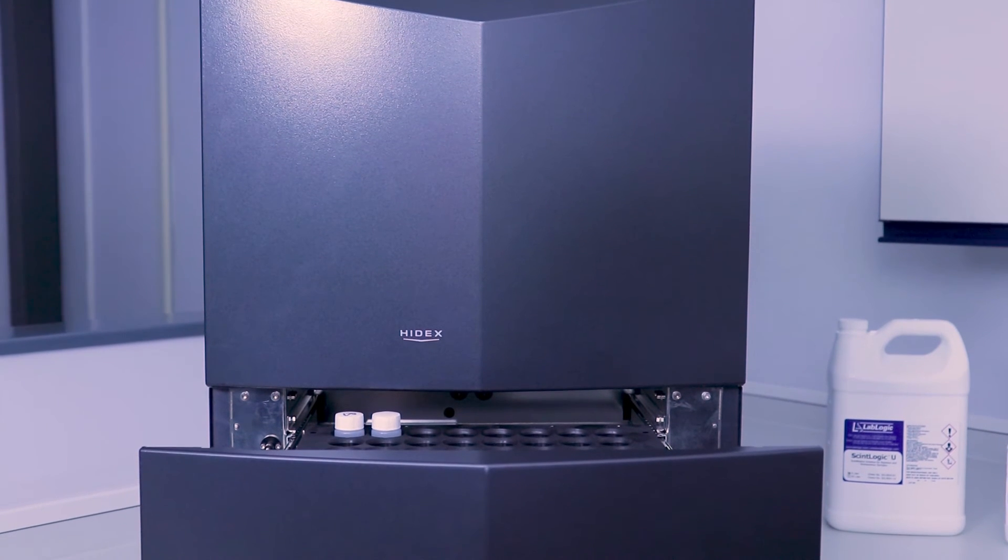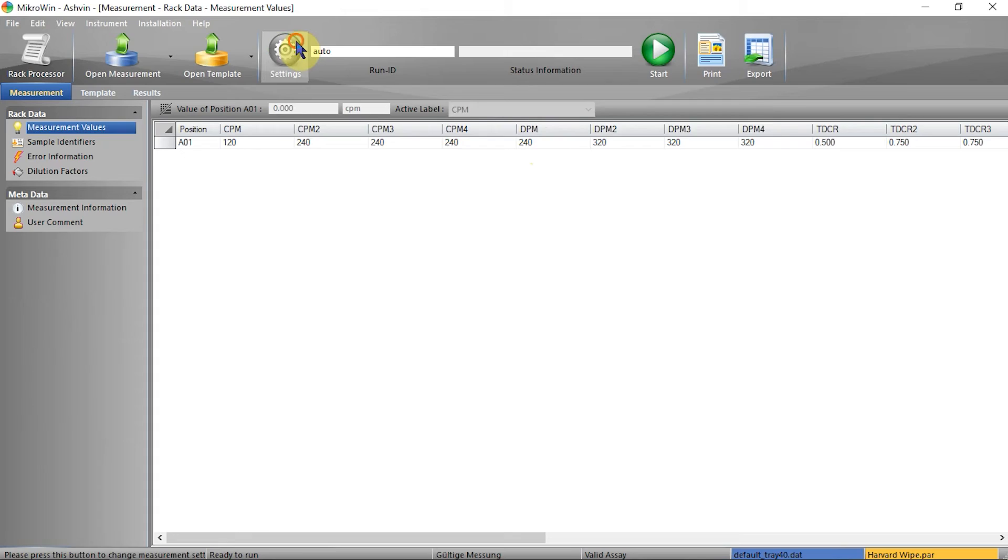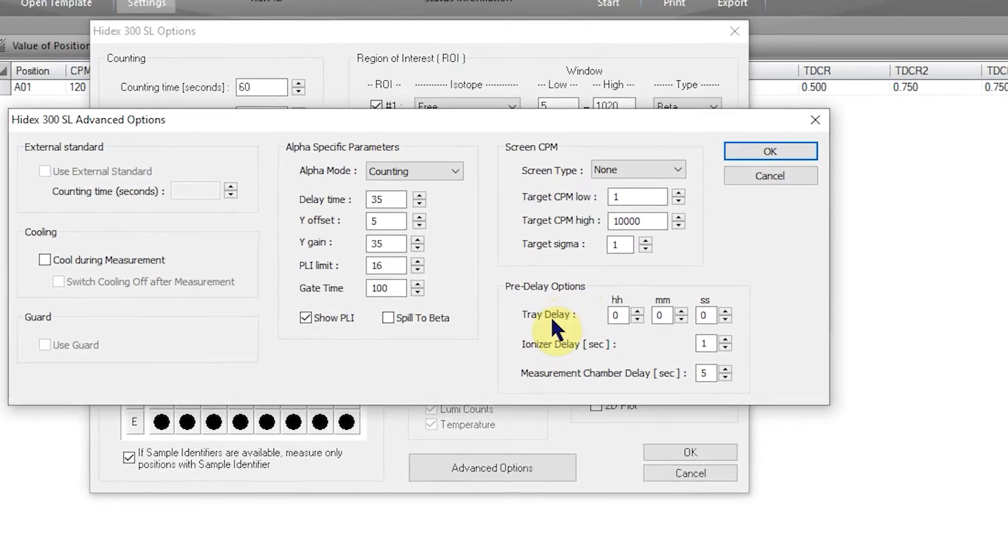You can also place in a drawer for dark adaptation to remove luminescence, or in the Micro Win software you can set a delay to dark adapt.